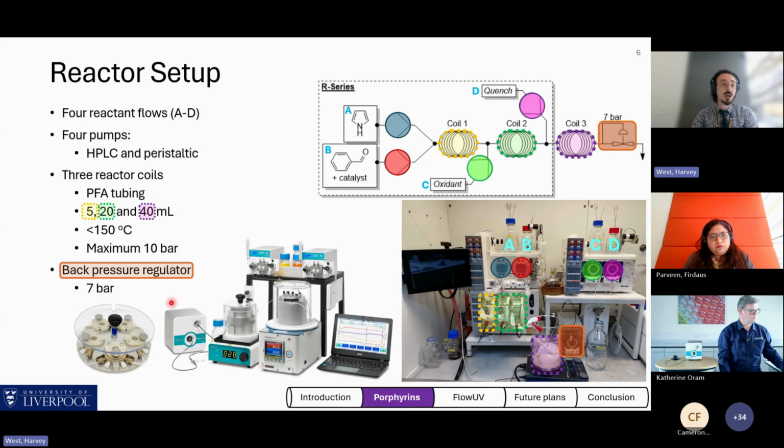And systems like this are often really quite well designed to allow almost immediate and really quite facile integration with inline analysis. As my colleague Firdaus mentioned as well, we can work with devices called continuous stirred tank reactors, or CSTRs, where through the use of wider bore tubing and a cascade of small tank reactors, we can achieve really quite tight control over our residence time distribution and negate some of the common issues with flow chemistry of blockages or solid material, say, crashing out in solution.